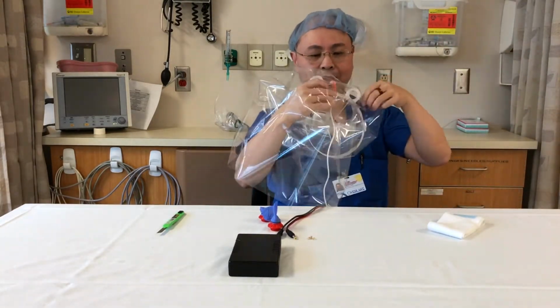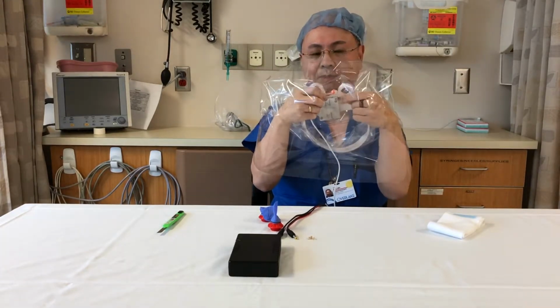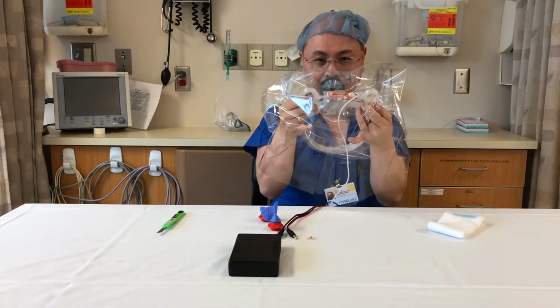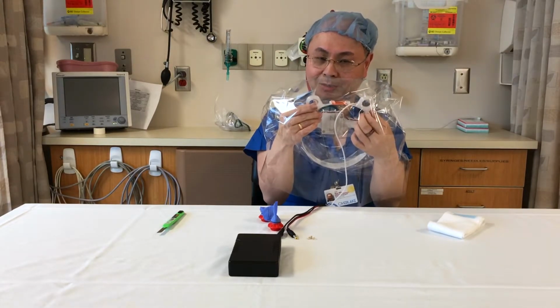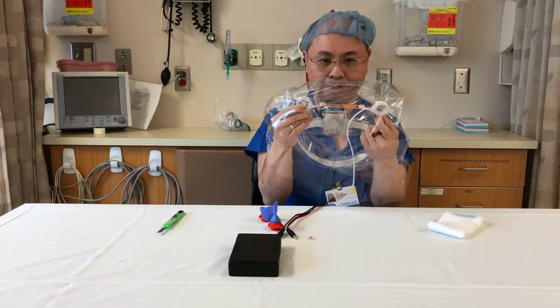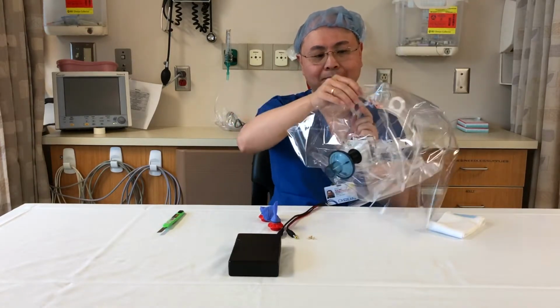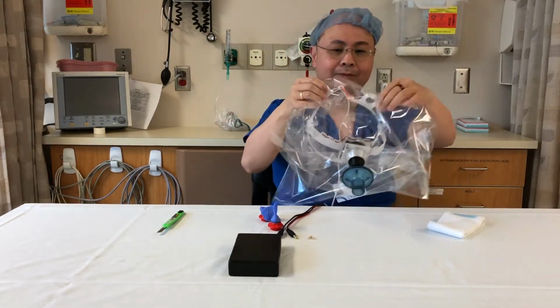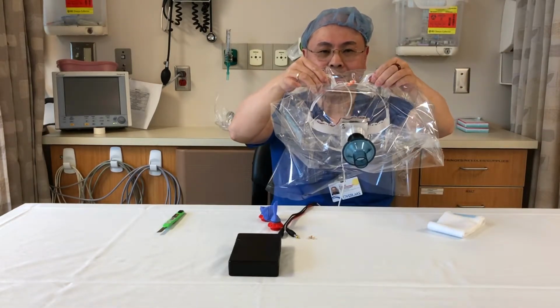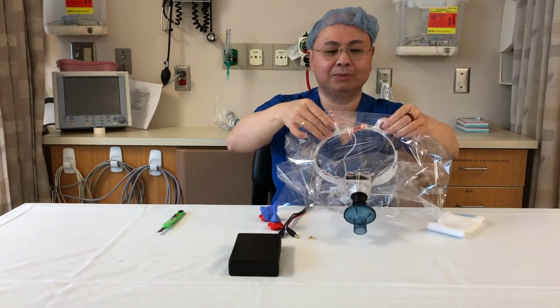You'll notice that the PAPR itself, if you look at the frame, when it goes on your head, it actually stretches apart. That's how it gets a custom fit for your head. But of course, the rubber band wants to hold it in the together position. But we actually want it to be able to stretch when you put it on your head. So be careful when you position the plastic bag. You don't want the bag to become the limiting factor in how well this spreads apart. Leave yourself some room.